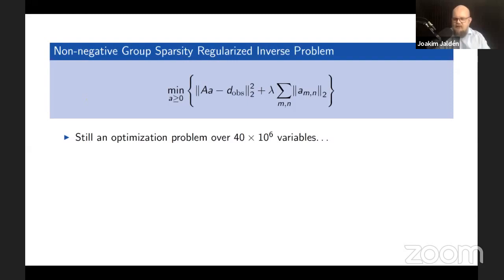Then if you were interested in the question of whether there is a single cell producing protein A and some other cell producing protein B, or if there's one and the same cell in the immune response that produces both of them, you can answer that by doing this analysis and then aligning the images.